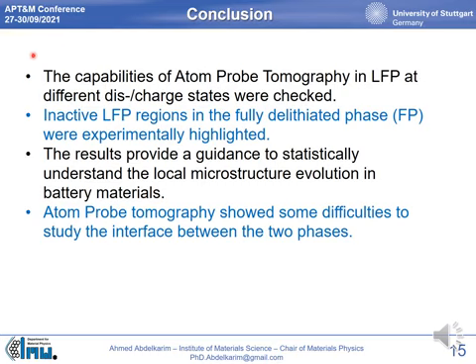Conclusion: the capabilities of atom probe tomography in studying lithium iron phosphate at different discharge and charge states were checked. Inactive lithium iron phosphate regions in the fully delithiated phase iron phosphate were experimentally highlighted. The results provide guidance to statistically understand the local microstructure evolution in battery materials. On the other hand, atom probe tomography showed some difficulties in studying the interface between the two phases.